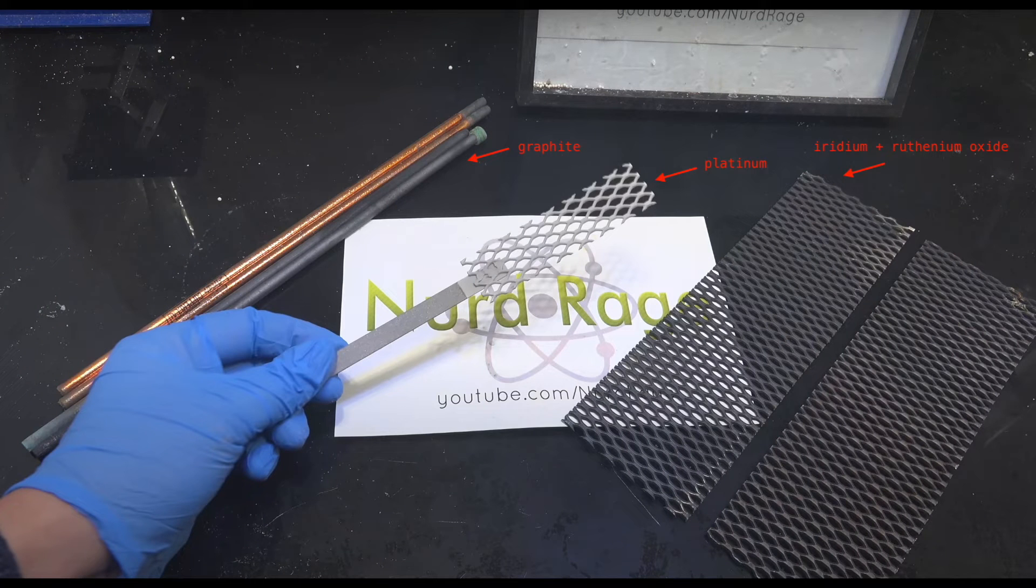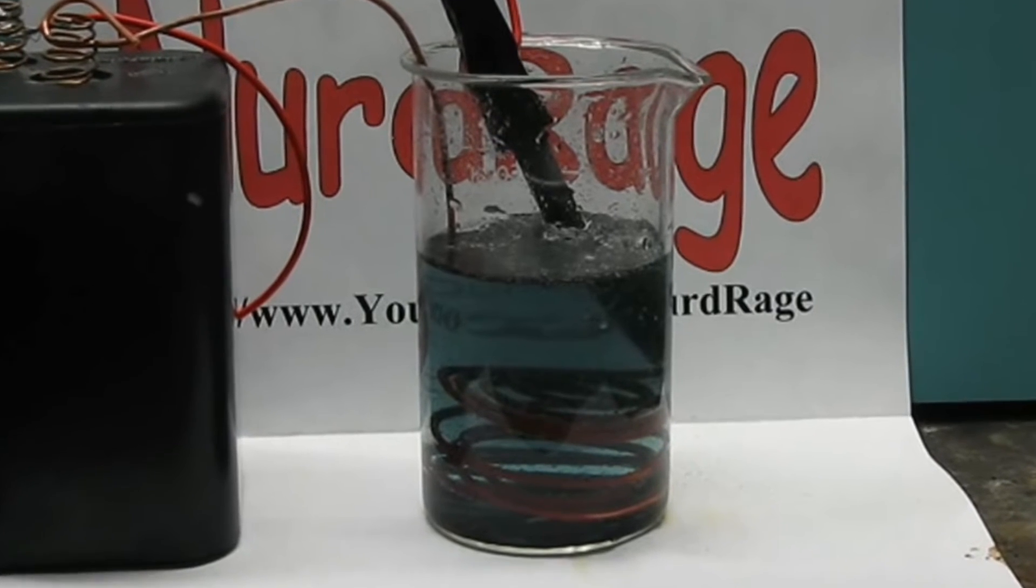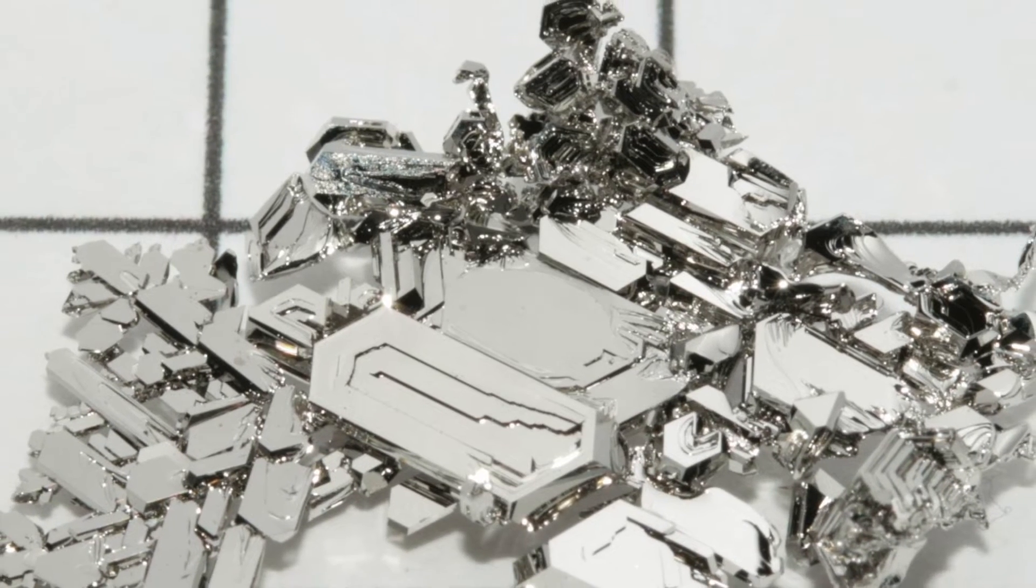Common anode materials are graphite and platinum, but graphite contaminates the solution with tiny particles of it, while platinum is obviously very expensive.